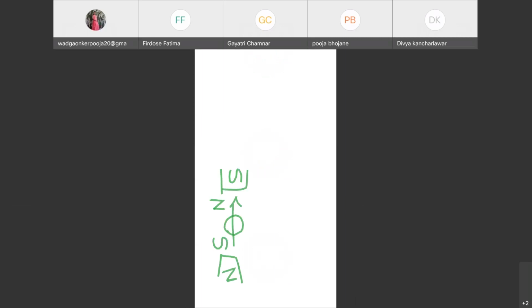Now whenever you have your magnets at that time, what happens, ये भी मतलब बार मैग्नेट ही है. हाँ, सो ये जो कुछ भी साउथ पोल है, नॉर्थ पोल है. अब इसके बाद में आपके इस न्यूक्लियाई पे आप क्या कर रहे हो, रेडियो वेव्स डाल रहे हो. क्या डाल रहे हो, रेडियो वेव्स डाल रहे हो.